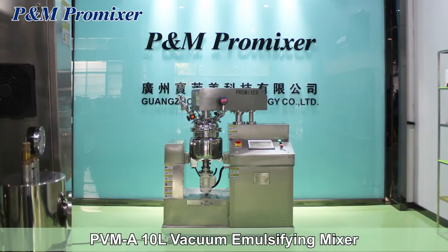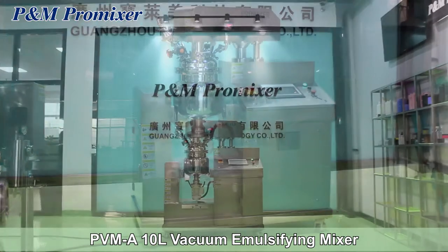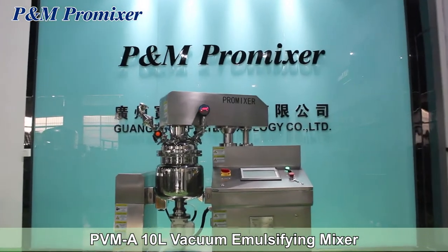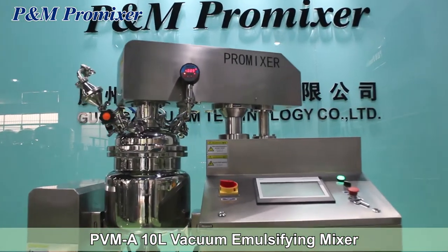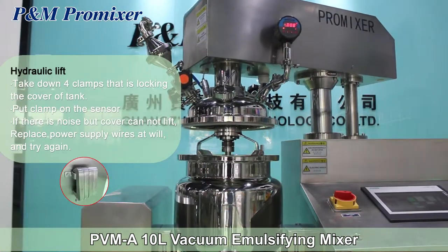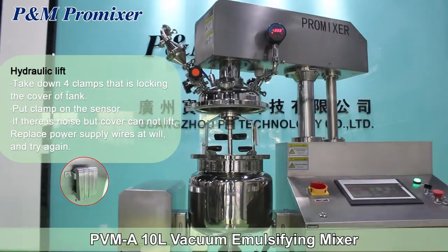PVM, a 10-liter vacuum emulsifying mixer. Hydraulic lift: take down the four clamps that are locking the cover of the tank, then put the clamp on the sensor.